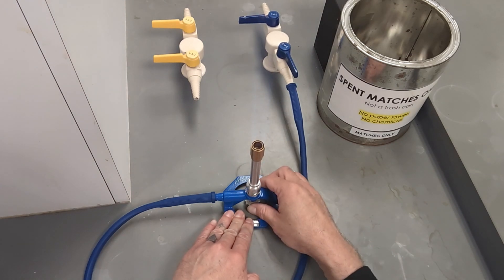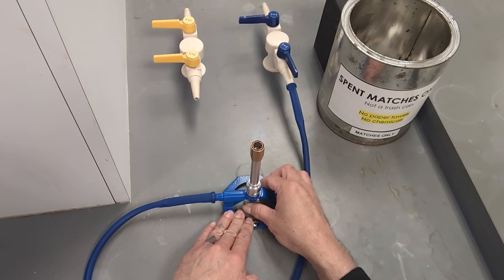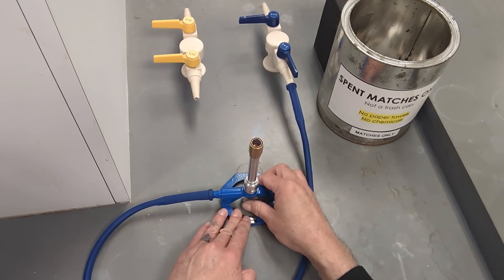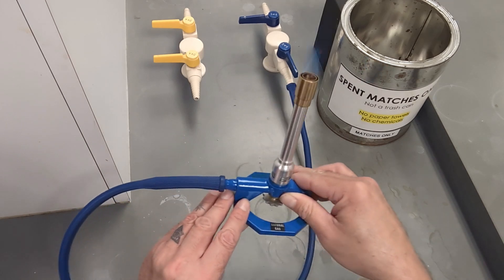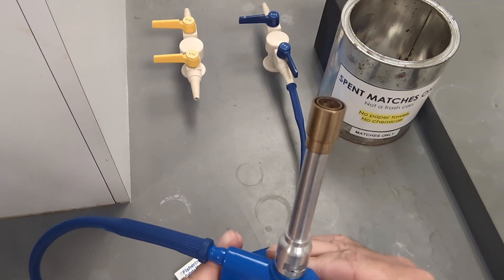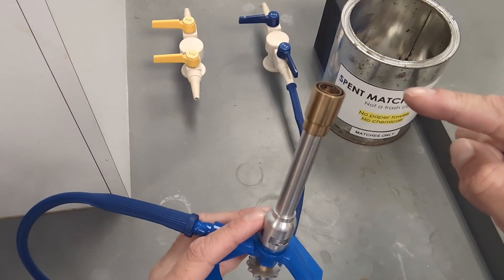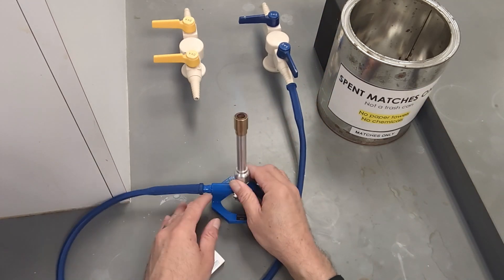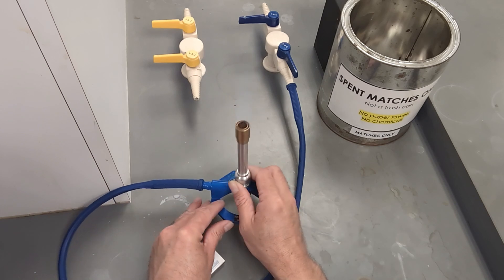And after lighting the Bunsen burner you can adjust the flame by opening the collar and the stopcock to make sure you have a small blue hot flame for any necessary hot heating procedures you may need.